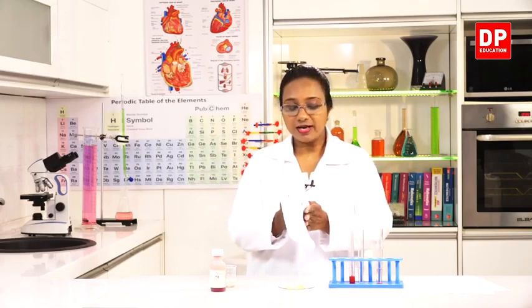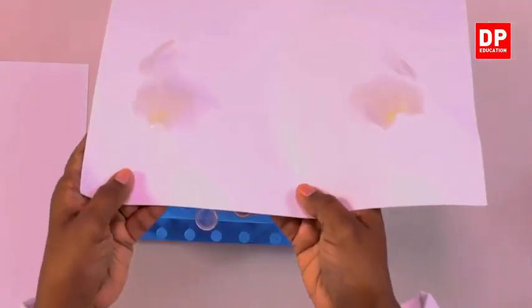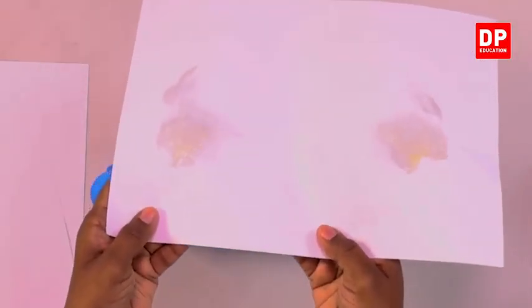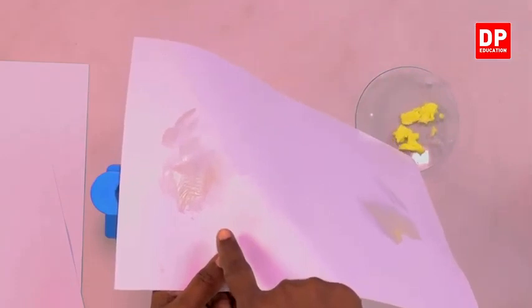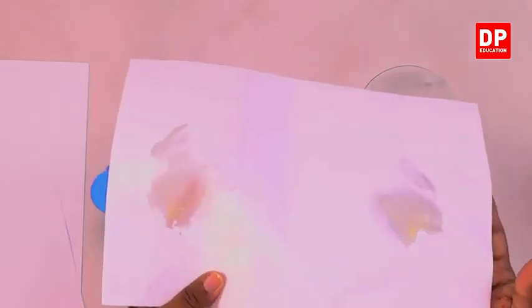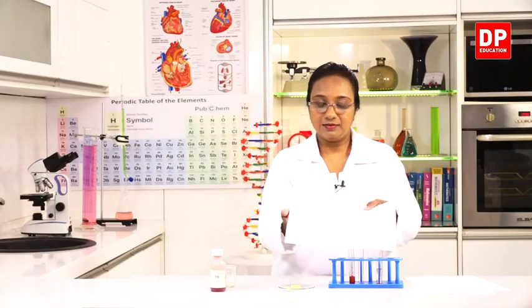When you fold the white paper and rub both papers together, you will see this translucent patch. Here you can see a translucent patch. This appearance of the translucent patch confirms that the substance we used is a fat. In other words, it is a type of lipid.